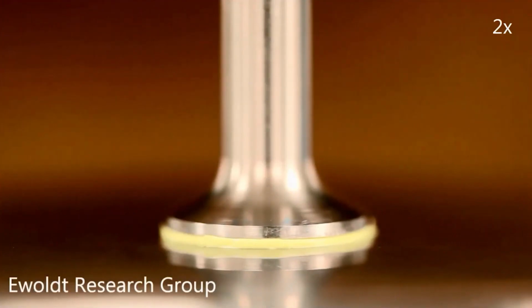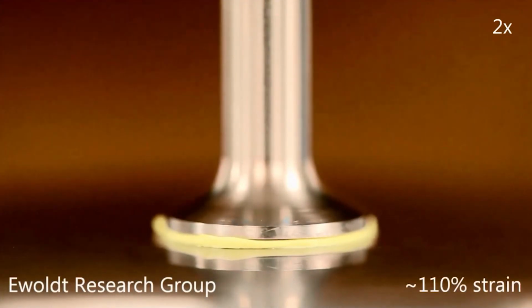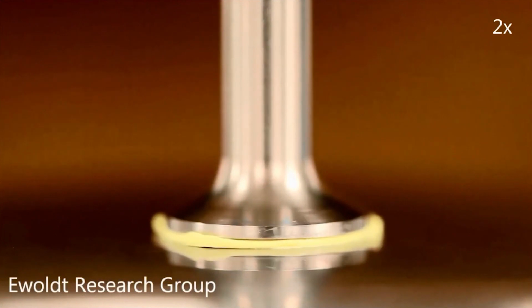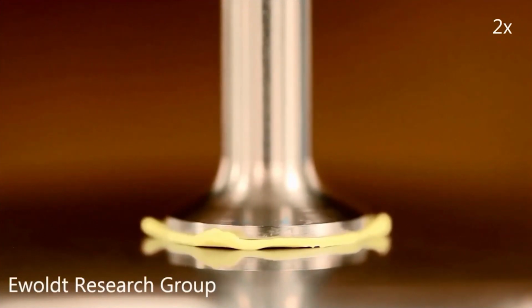So here's a video taken with a macro lens to get a nice zoom in, and we started at 43% amplitude with the video that I'm showing here. And things started off looking good, but you see some things developing that are non-ideal. The sample starts squeezing out of the back left there. We've cranked up the amplitude now, as you can see. You see some slip in addition to this edge failure where we have a non-ideal edge condition.